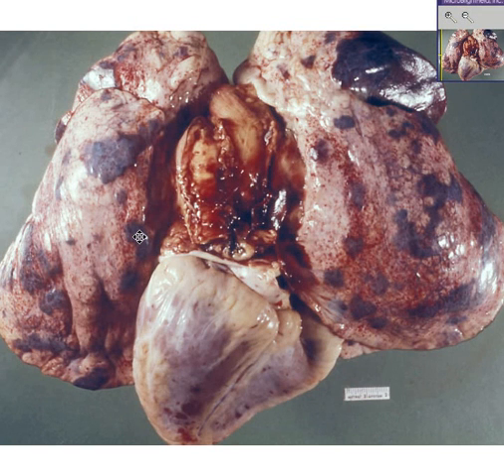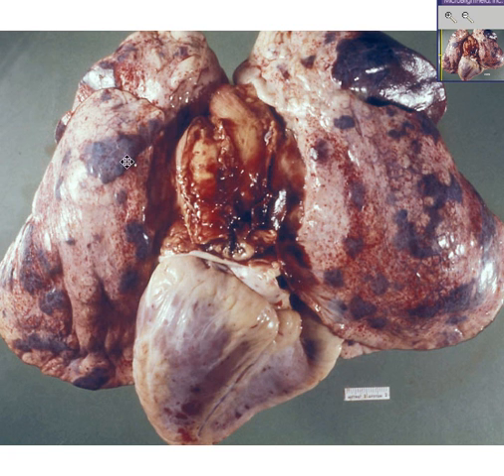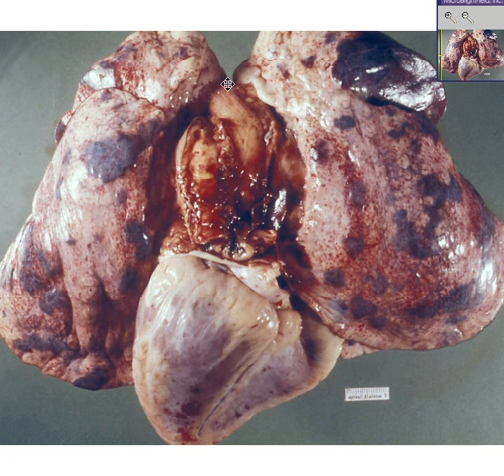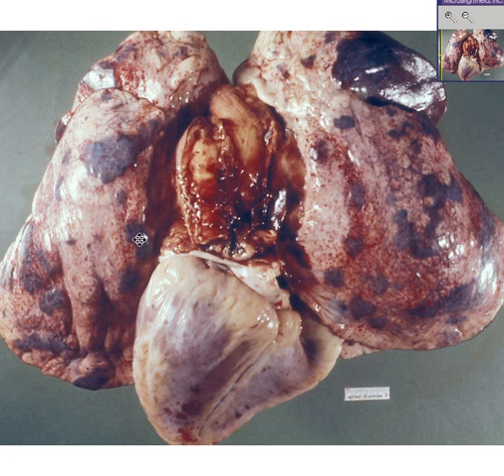You can recognize this as being a heart and a couple of lungs. You can also recognize the fact that along the surface of the lung there are these purplish hemorrhagic areas — here, here, here, here, here, here, here, here, and here. There is clearly a collection of hemorrhage along the periphery of the lung.